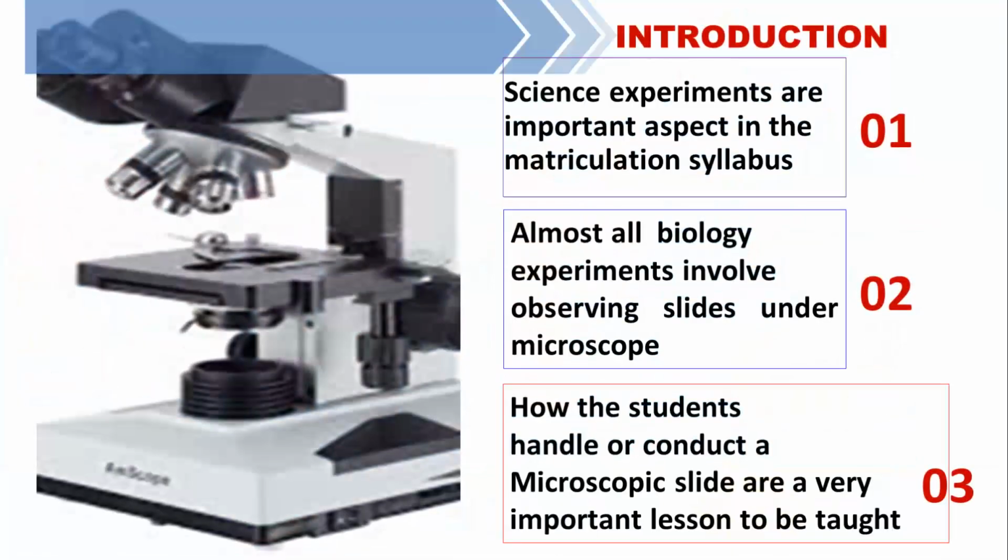Science experiments are an important aspect in the matriculation syllabus. Almost all biology experiments involve observing slides under a microscope, and how students handle or conduct a microscopic slide is a very important lesson to be taught.